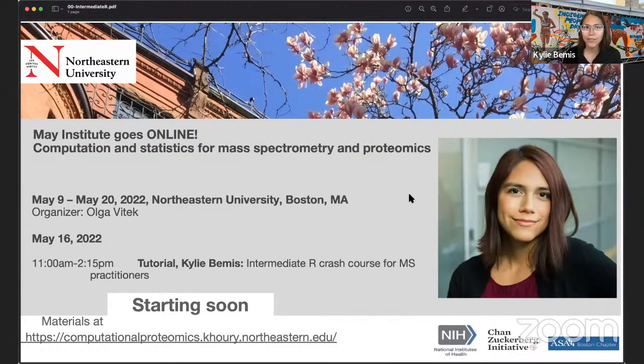Today we'll be going through a lot of slightly intermediate to advanced R materials. The idea is we're going in assuming that you have used R before, that you have written some of your own scripts for analyzing data. You've used various R packages before for analyzing data, maybe some of ours, whether MSstats or Cardinal or say MSnbase or something like that. But you don't necessarily have all of the advanced skills to, say, develop a package or perhaps even write functions and things like that.